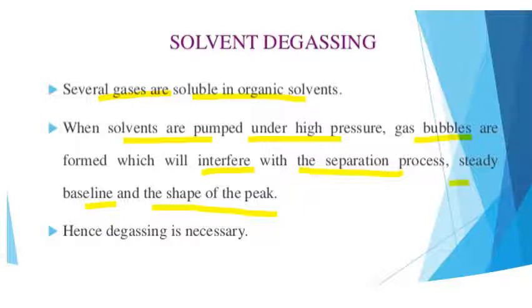It is very necessary to remove these gases as well as the impurities present in the solvent. That's why degassing is necessary, and why this is also called solvent degassing.